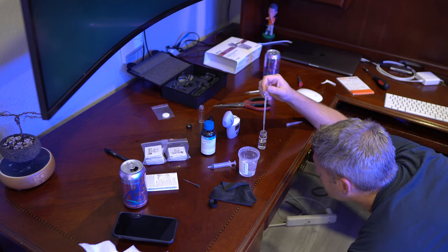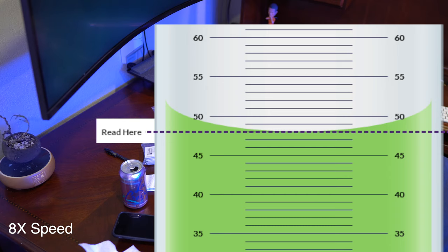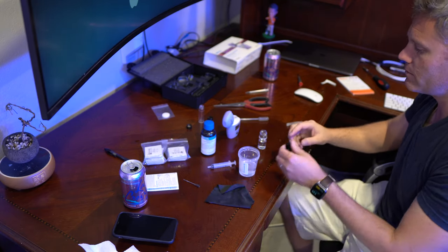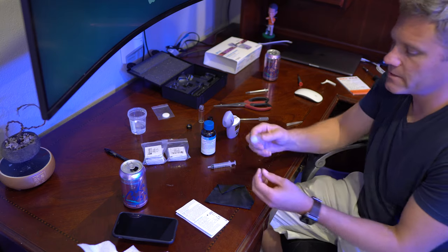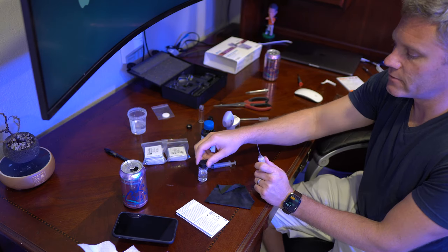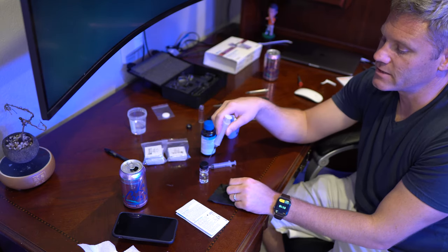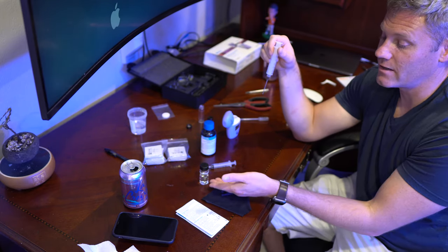Water has a concave meniscus, and you want to read from the very bottom of the curve — as shown in the picture. Now I have exactly ten milliliters in my mixing vial. Put the cap on and give it a little shake and swirl to make sure it's mixed up. Now take this syringe, screw in the blunt needle, and pull out exactly seven milliliters from your diluted solution. Pull out seven milliliters, dump the remaining three, and then put the seven milliliters back into the big vial. You could just subtract three, dump that out, and you've got your seven in there.